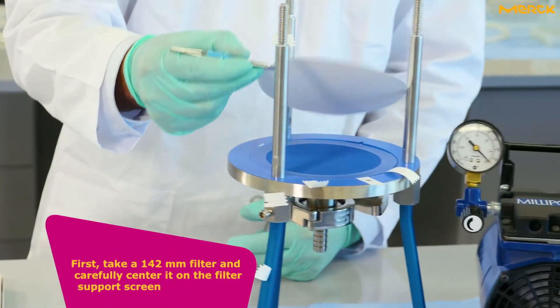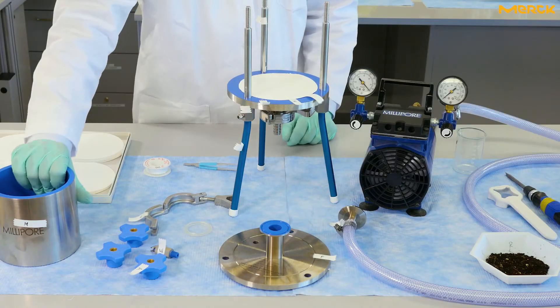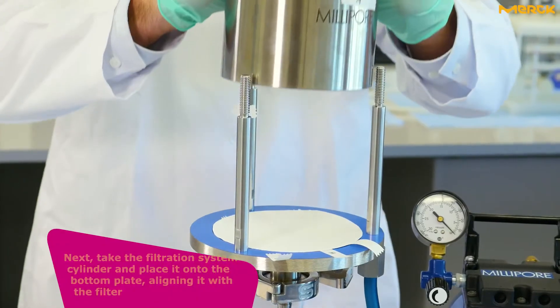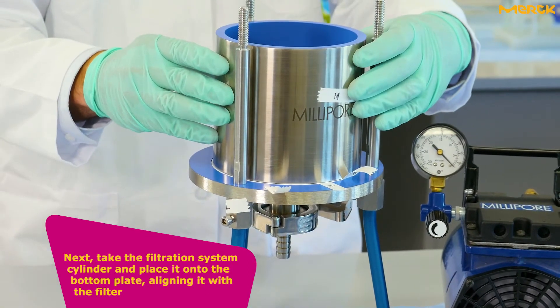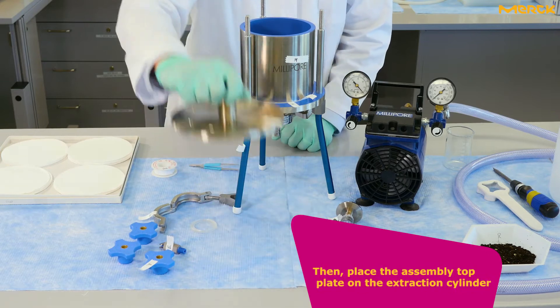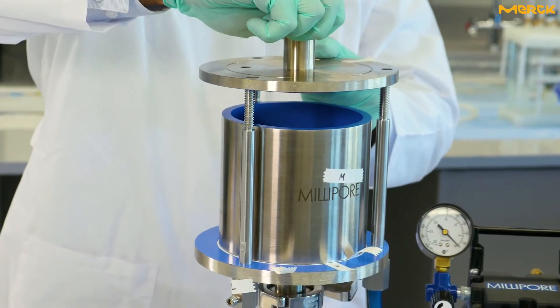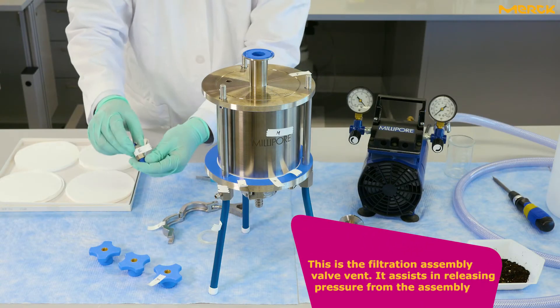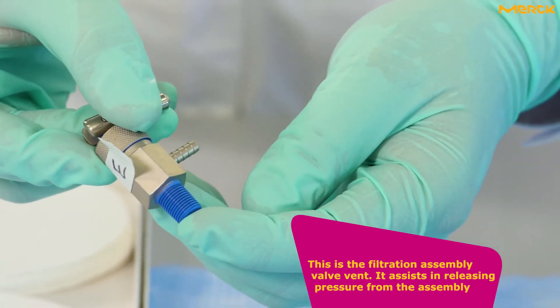First, take a 142 millimeter filter and carefully center it on the filter support screen. Next, take the filtration system cylinder and place it onto the bottom plate, aligning it with the filter. Then place the assembly top plate on the extraction cylinder.